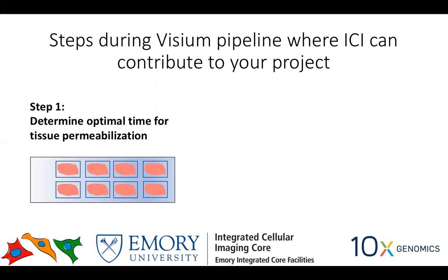So steps during the Visium pipeline where we really contribute to your project. So the first step is to determine the optimal time for tissue permeabilization. So Visium is going to give you 2 slides. One slide on which you have these 8 different squares on which you will put your tissue. One of the squares is going to be a positive control. The second square is your negative control. And for the rest of the squares, you will end up putting your tissue and then look for the permeabilization time based on the binding ability of the probe.